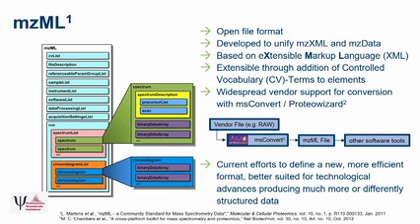At the moment, there is also an effort to define a new, more efficient format that is better suited for technological advances that have been made in the past few years, and also tries to be more efficient towards large-scale data.